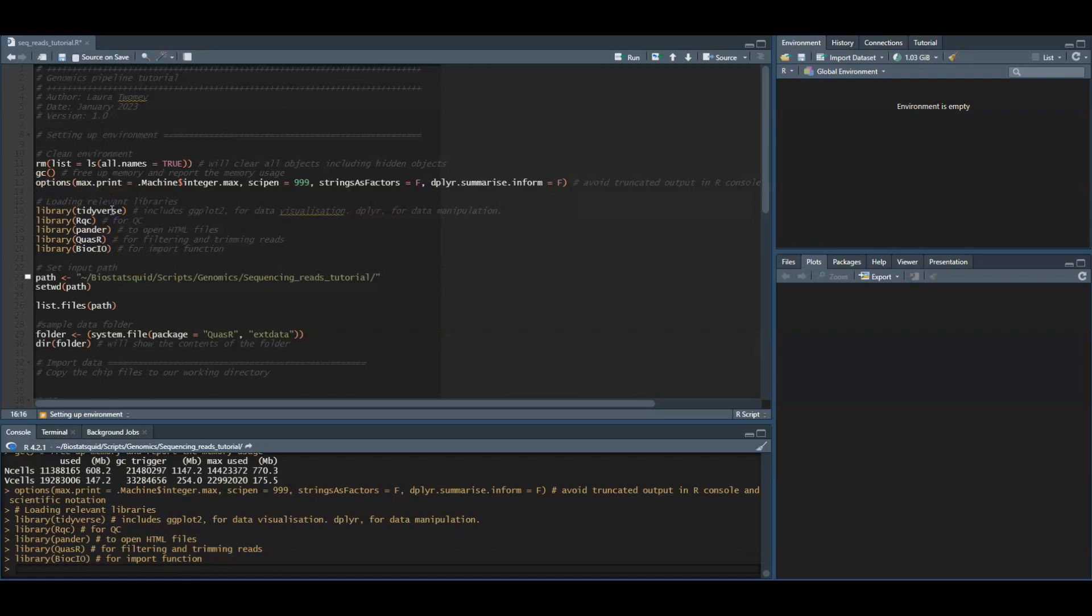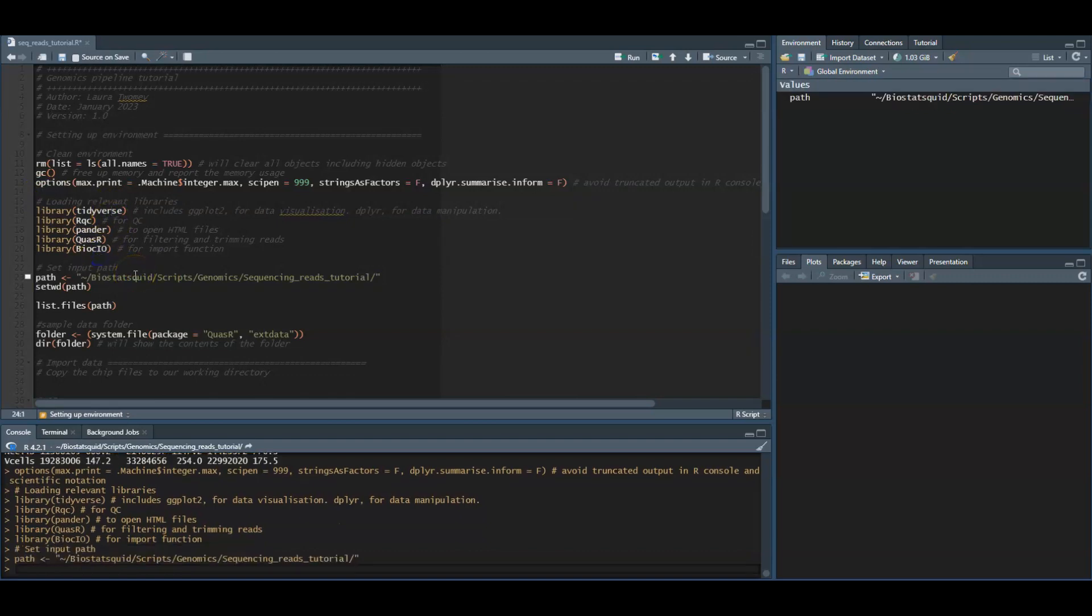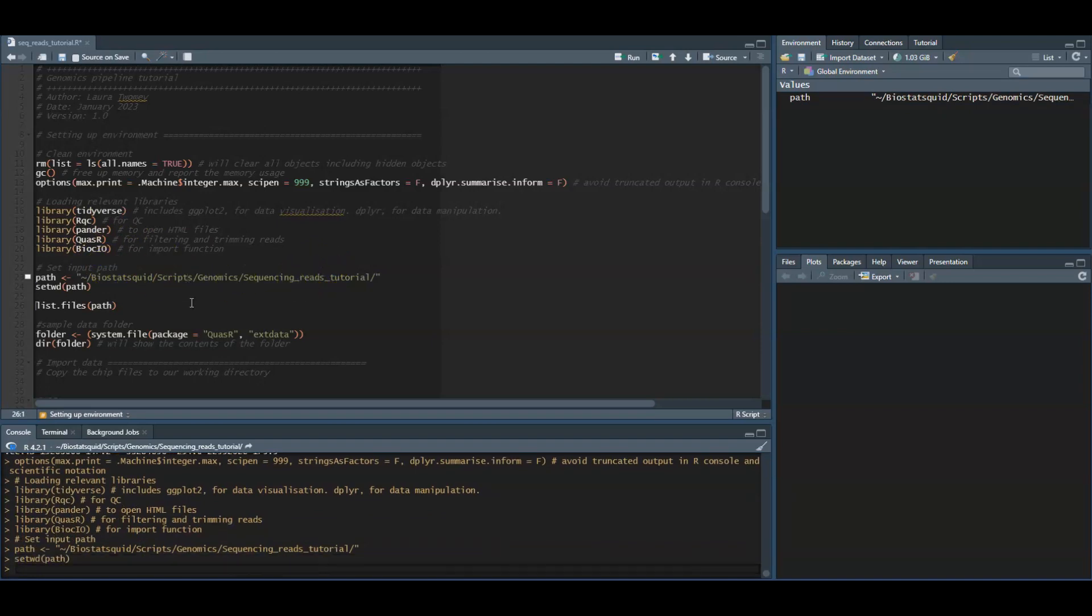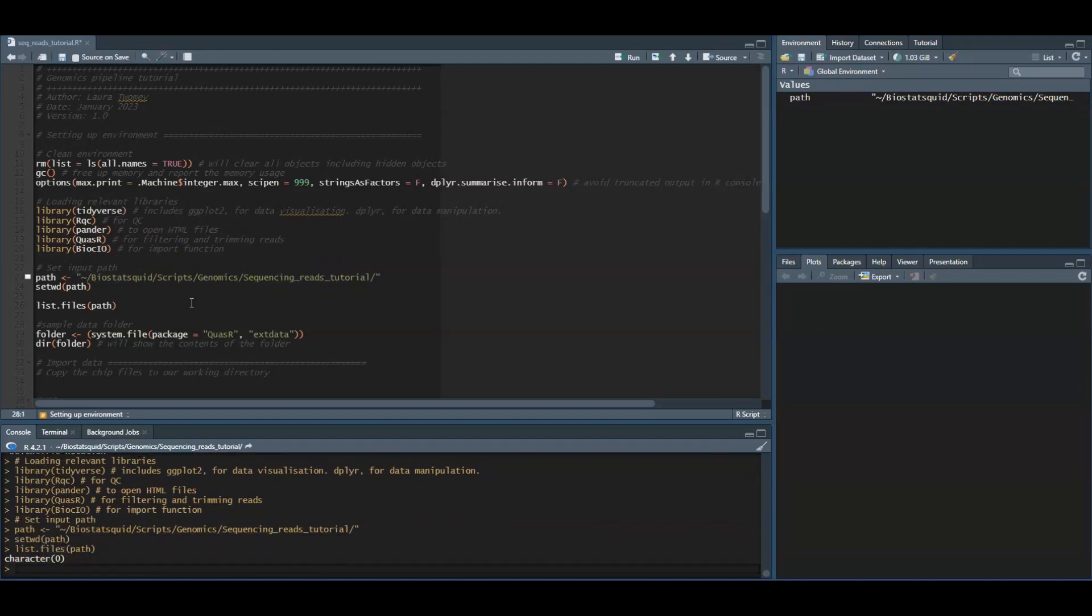This is the folder I'll be working in and I set my working directory to this path. I can list the files in this path and as you can see right now there are no files.